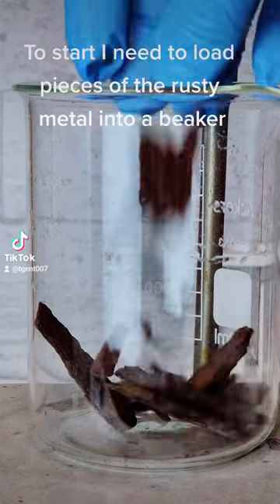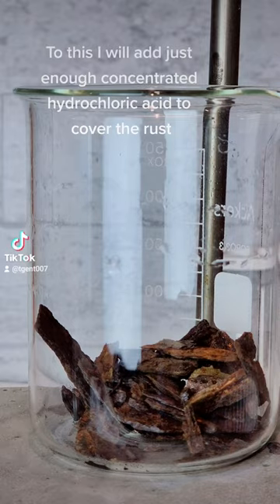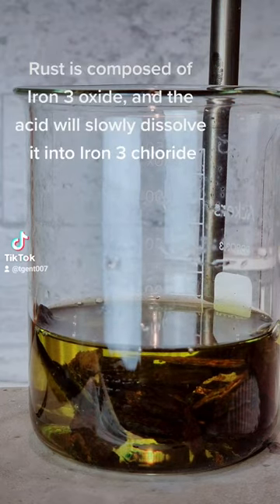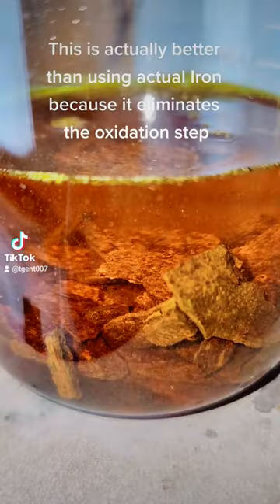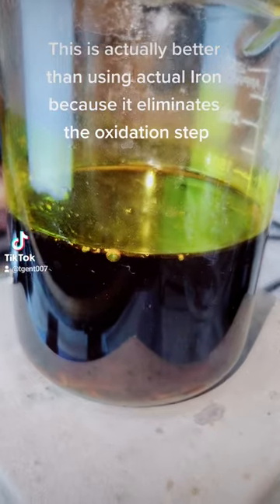To start I need to load pieces of the rusty metal into a beaker. To this I will add just enough concentrated hydrochloric acid to cover the rust. Rust is composed of iron oxide and the acid will slowly dissolve it into iron chloride. This is actually better than using actual iron because it eliminates the oxidation step.